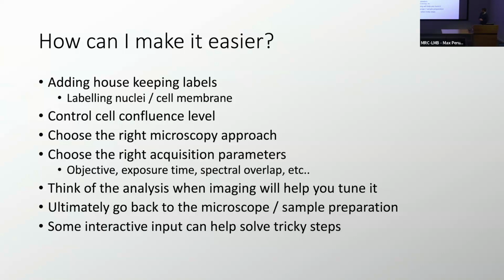We want to choose the right microscopy approach. It's useless to use a super resolution microscopy approach, like Nick will talk about next Tuesday, to image just a big average over the whole cell. You will waste your time, storage, my patience. But not my patience, I will just end up downscaling your image, or you will do the same. And basically it's just a bad practice.